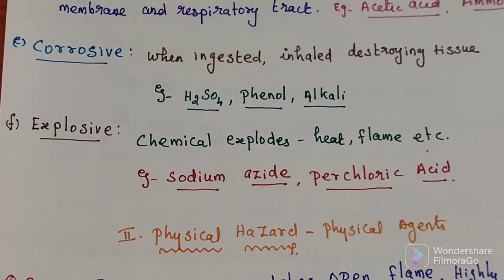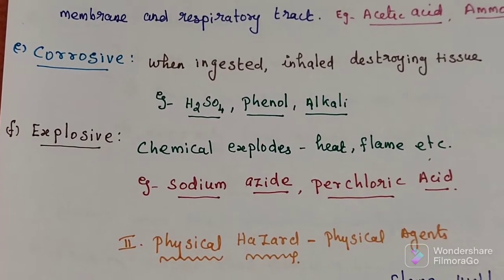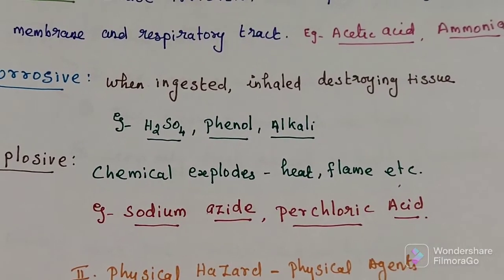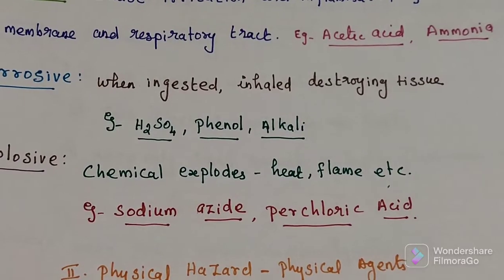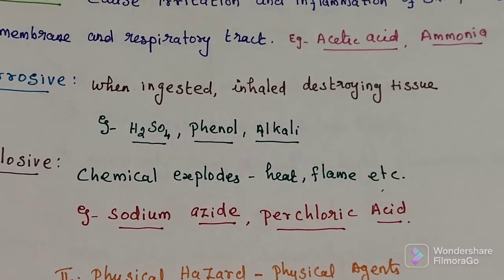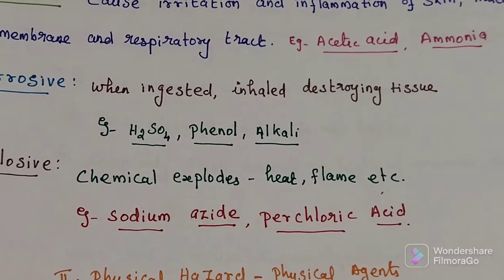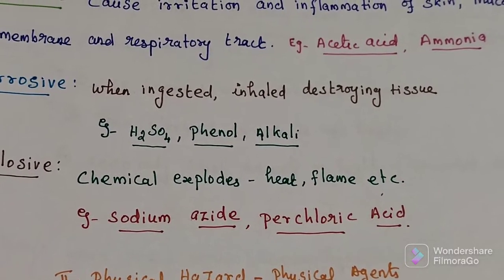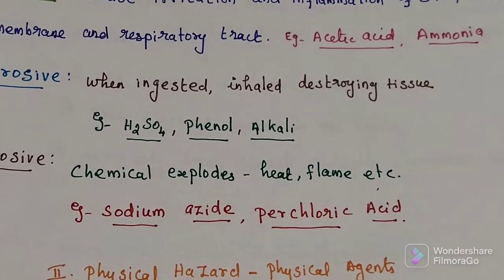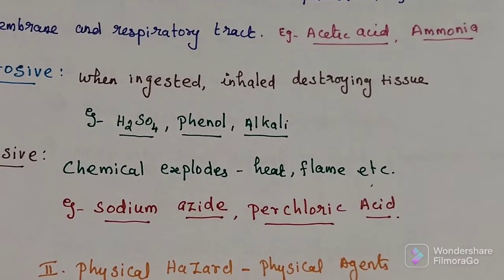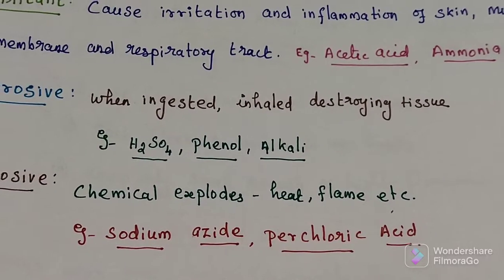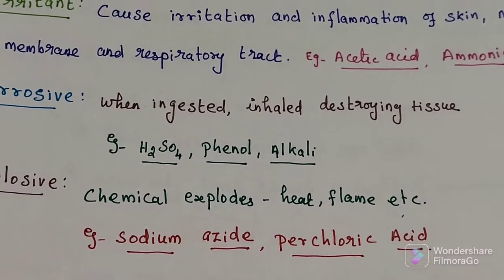The next type is corrosive. This chemical, when it comes into contact with or is inhaled, destroys living tissue. Many acids and alkaline substances are corrosive. Example: H2SO4, phenol, and alkaline compounds.